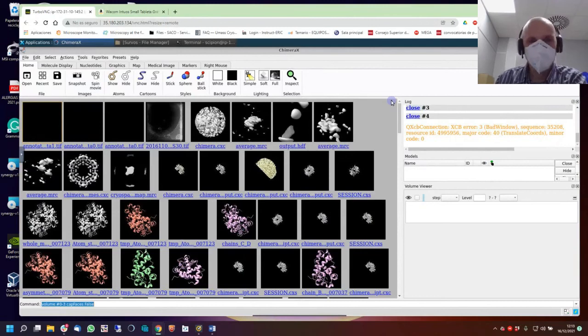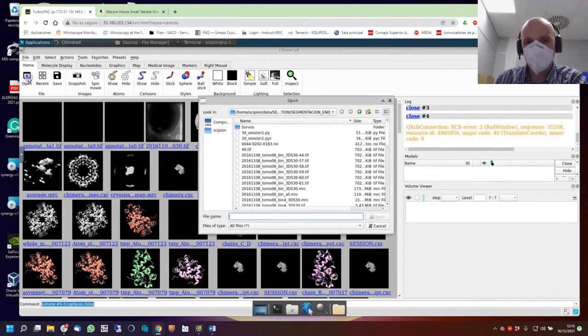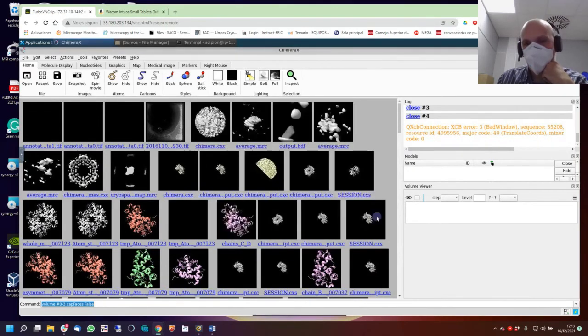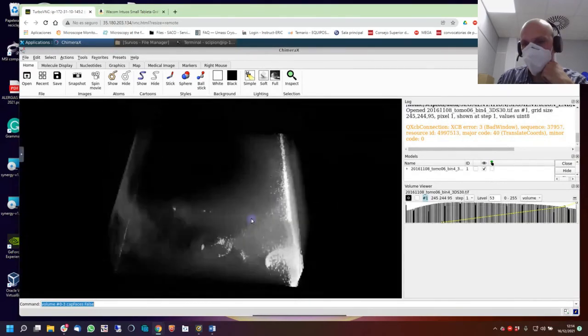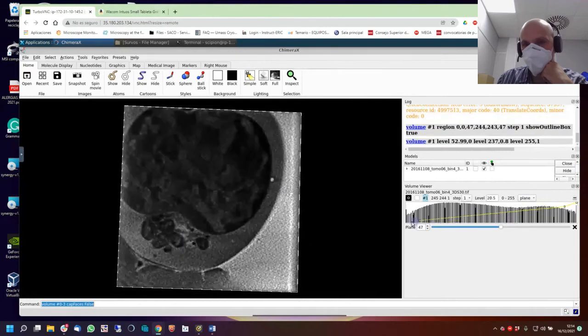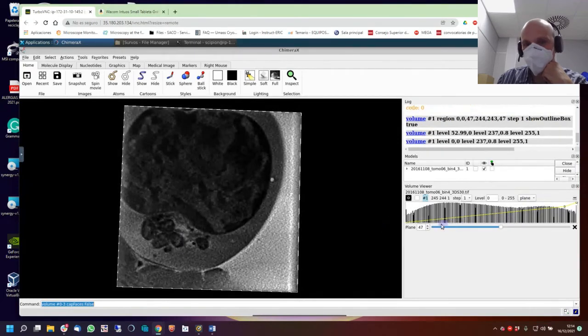Yeah, doesn't matter. So I open annotations. Open. Null, 0, data 0. Go for this for a moment to start with the whole volume. Okay. Let's use this for example. See it? It will be the reference volume. Open. As I told you, this is not what we want. Go for plane here. And that's more normal. Okay. Got it? Yeah. So for the visualization, this is just the flat tomogram.